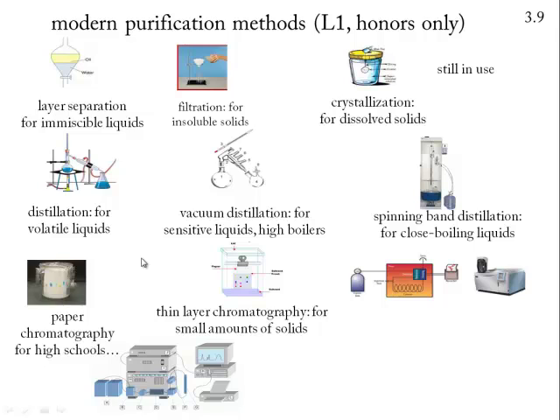As things scale up, they might become preparative TLC for a larger, thicker plate, or they might become liquid chromatography for a three-dimensional column of silica gel or some other solid support. And this method gets used over and over for soluble solids that are in a liquid mixture. And it works for complex mixtures as well. If they get really complex, you might want to go with, oh, I'm sorry, this is actually for gases. If you want to separate gases, you can use the same technique of adhesion to some solid layer, but you've got to be able to trap everything in the gaseous phase, and this is known as gas chromatography.